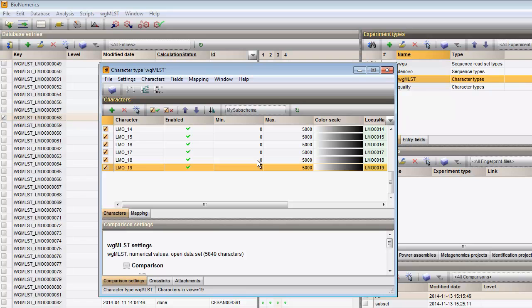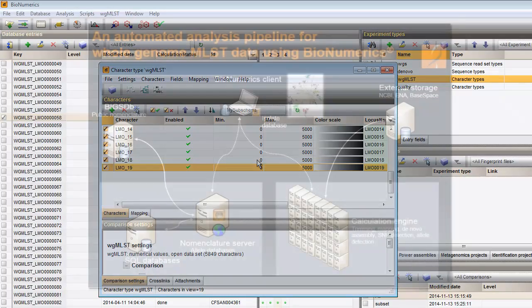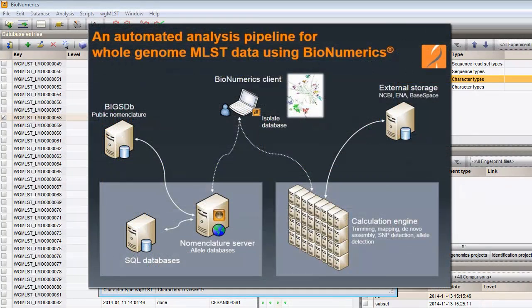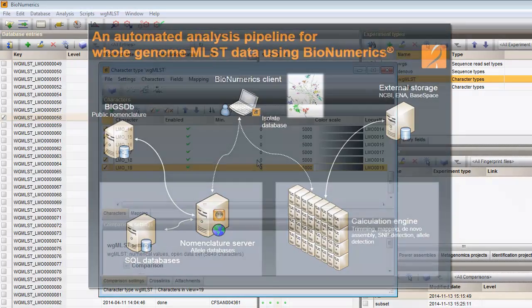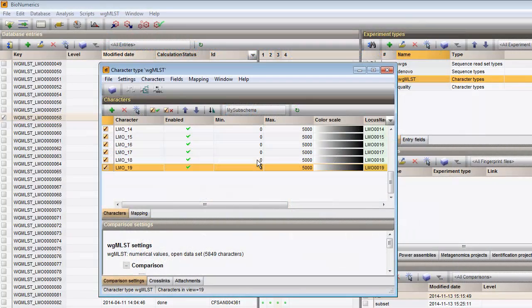Sequence types for whole genome MLST are defined on any subscheme that is present in the reference allele database. Validated subschemes will be uploaded to the client database upon synchronization.